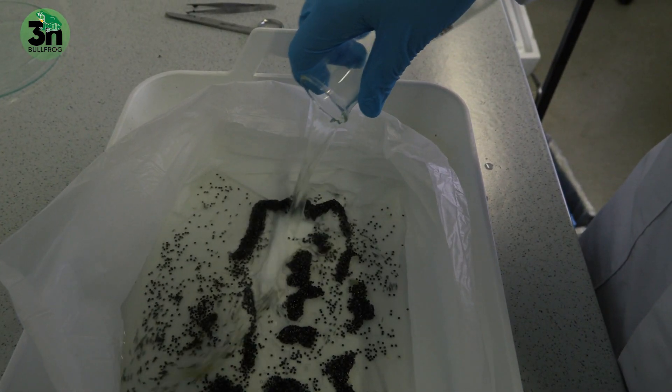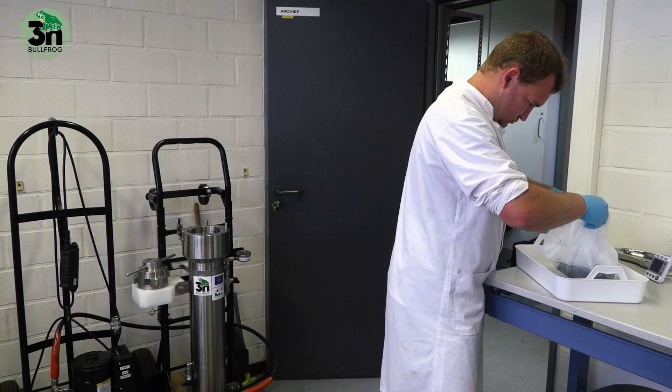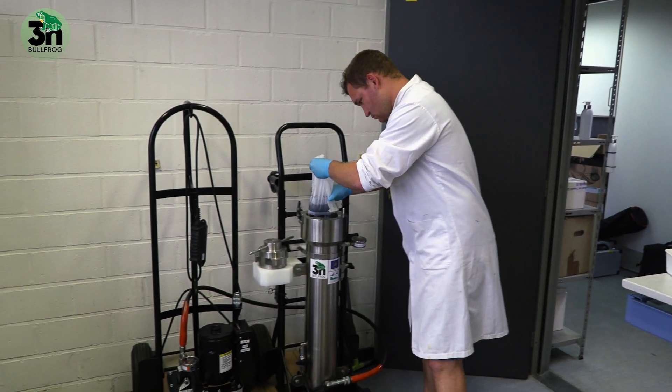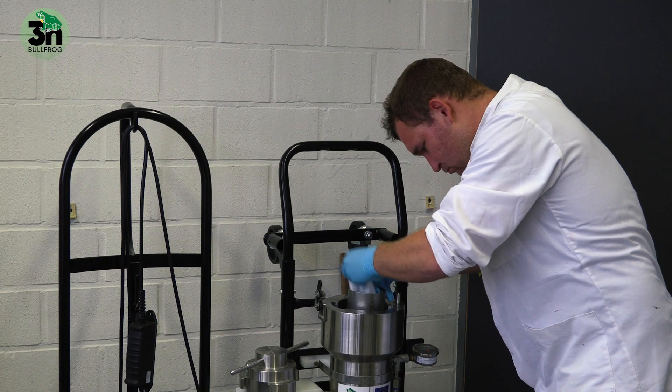This has to be timed very carefully because at a certain point in that process we need to put the eggs in a hydrostatic pressure chamber. That hydrostatic pressure chamber induces a very high pressure and it reaches 5000 PSI on the fertilized eggs.